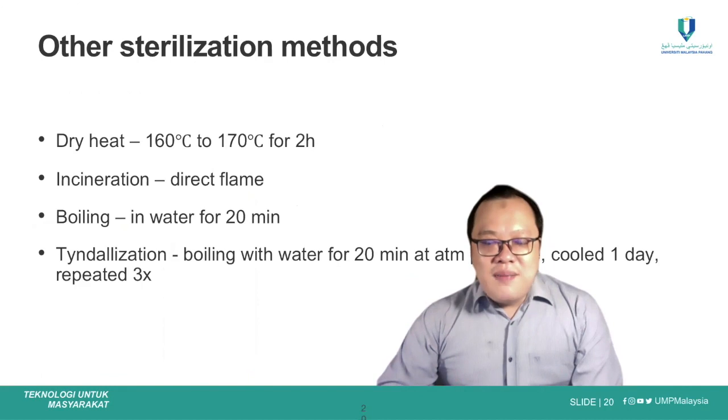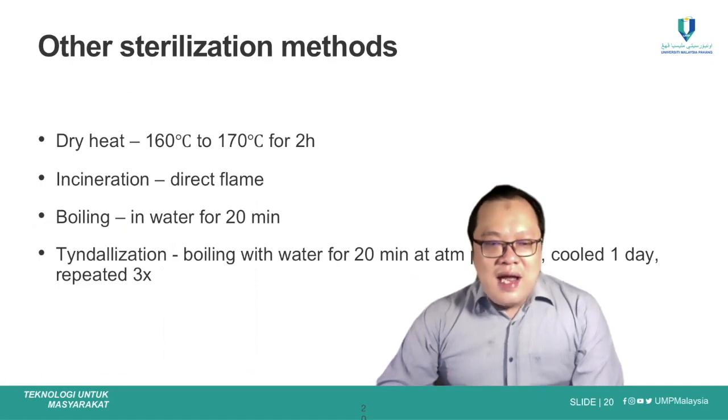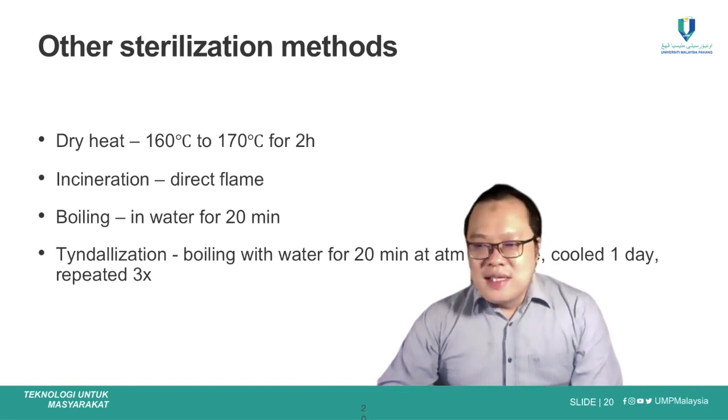Other sterilization methods can be used, but these are less effective compared to autoclaving or membrane filtration, such as dry heat at 160 degrees Celsius to 170 degrees Celsius for 2 hours.